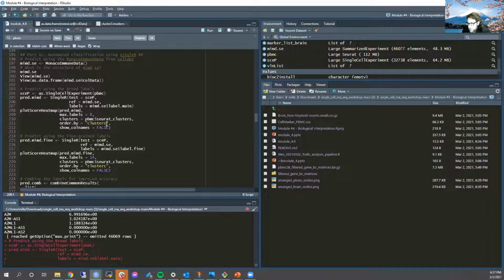It typically just takes a minute. Okay, so it didn't take that long. For every single cell in your SCE, which is your Seurat object, it's going to try to find the highest confidence label from the reference set that can describe that cell. So I'm pretty sure every single cell is going to get a label. It's just a question of whether or not it's accurate that ends up being more contentious. One of the ways that you can see your results is to plot them as a heat map, which Wes showed earlier. So let's go ahead and do that.